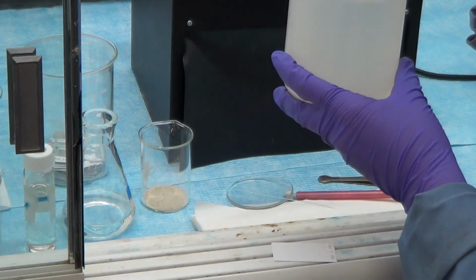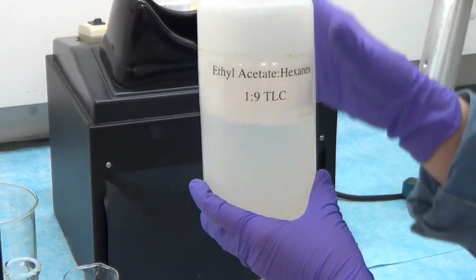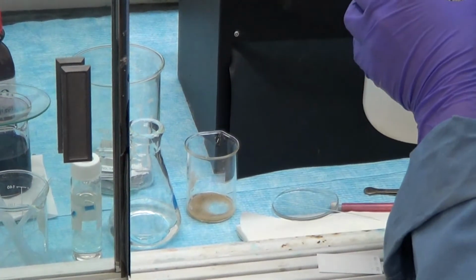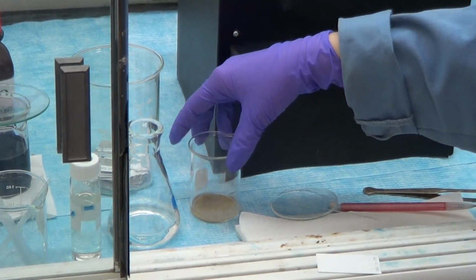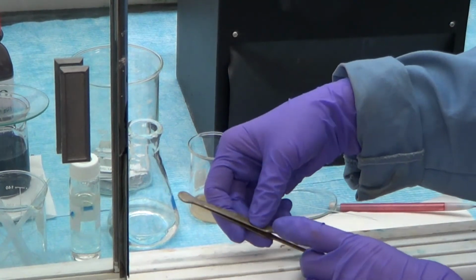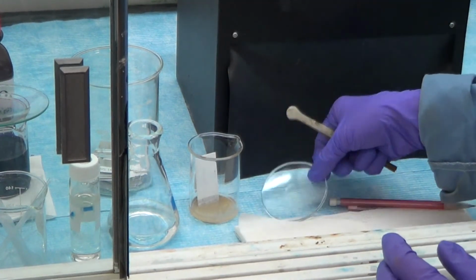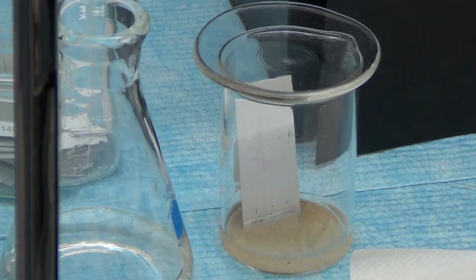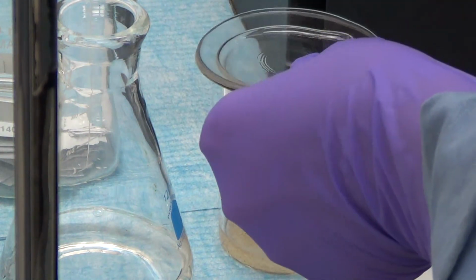The solvent system for this lab is a 1:9 mixture of ethyl acetate to hexanes. A small amount of this solvent is added to the bottom, and the TLC plate is added inside the chamber and covered. The solvent is allowed to elute up the TLC plate. Once about a centimeter from the top, the plate is removed and the solvent line is marked.